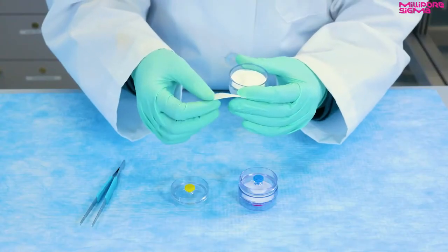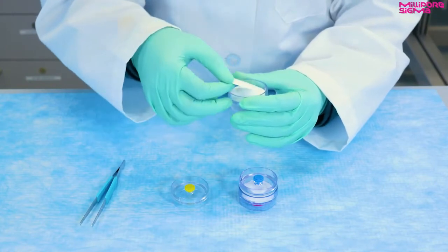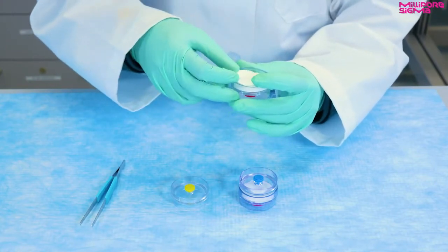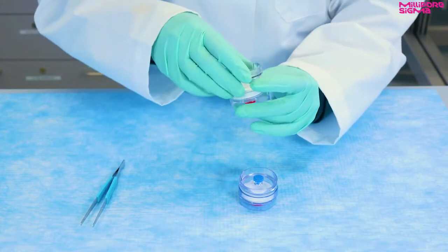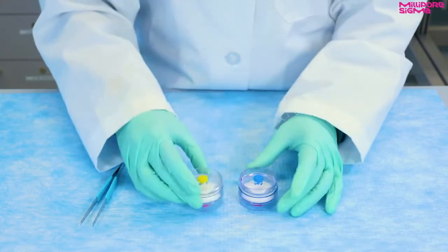The two filters are placed on top of the support pad inside the monitoring cassettes. The sample is collected on the top membrane filter and the bottom membrane filter is used as the tare weight in gravimetric analysis.